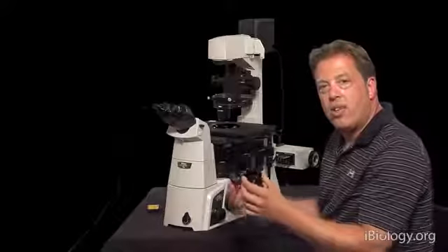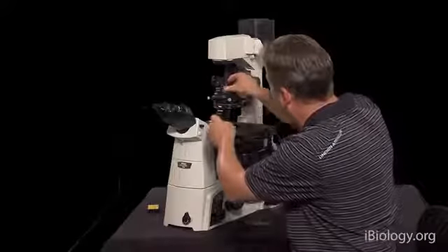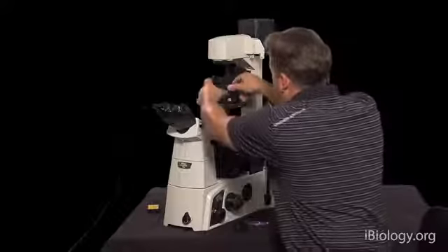So where these components sit on the microscope is the polarizer in the light path here, in the transmitted light path, which we've covered in previous lectures.